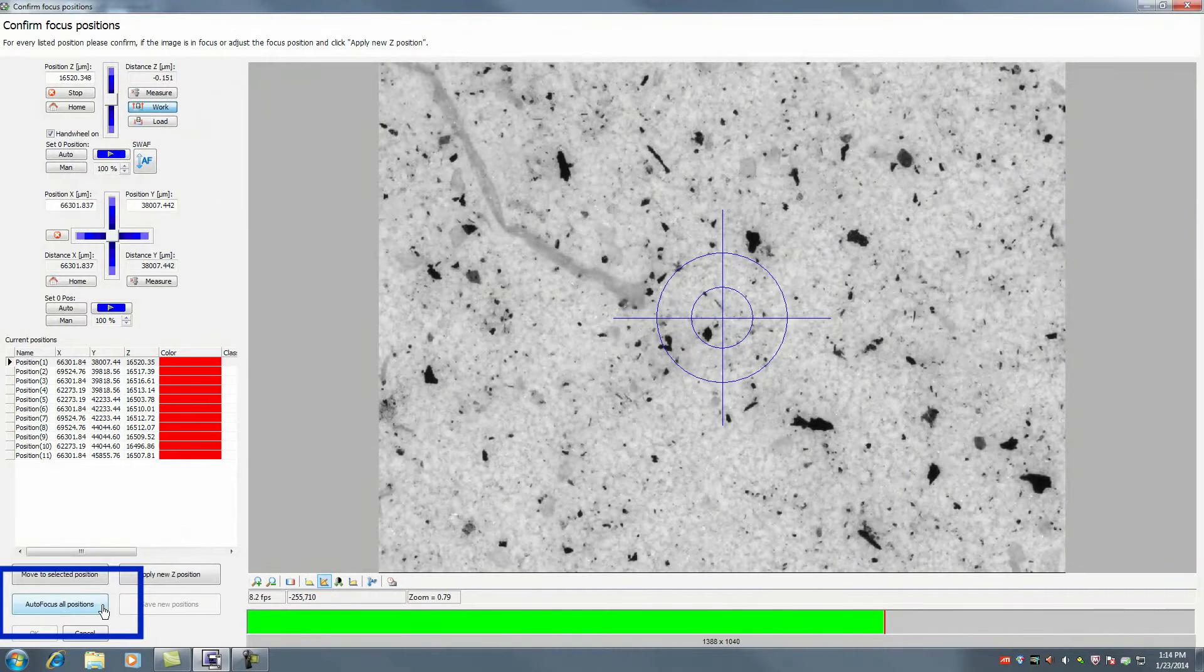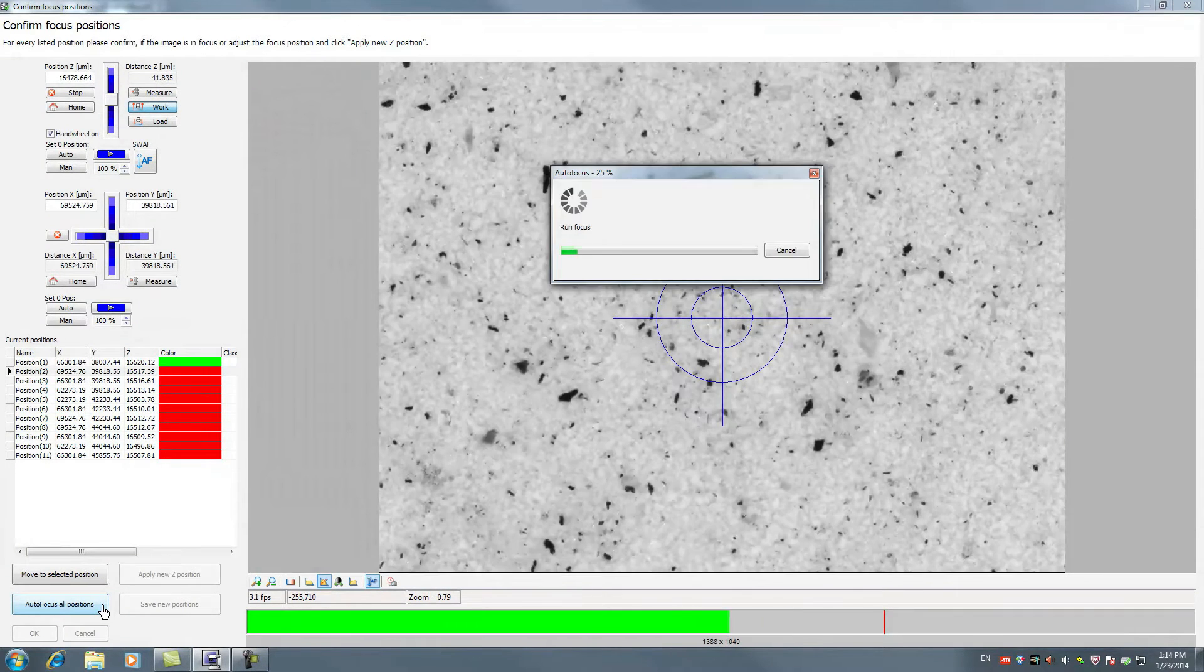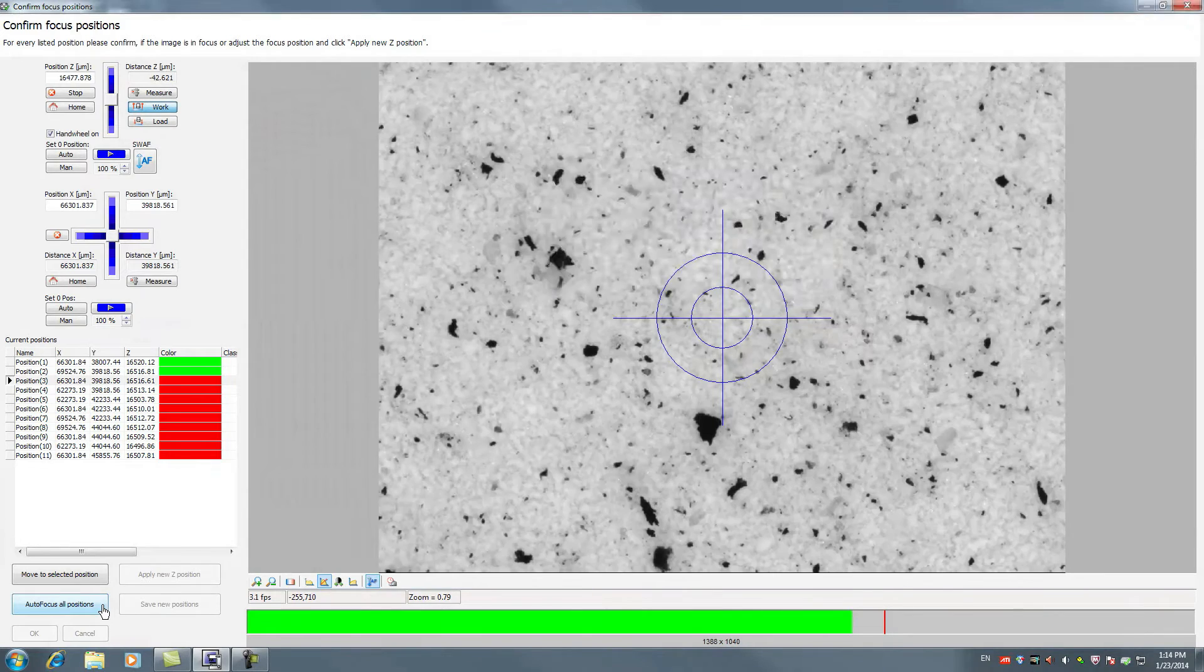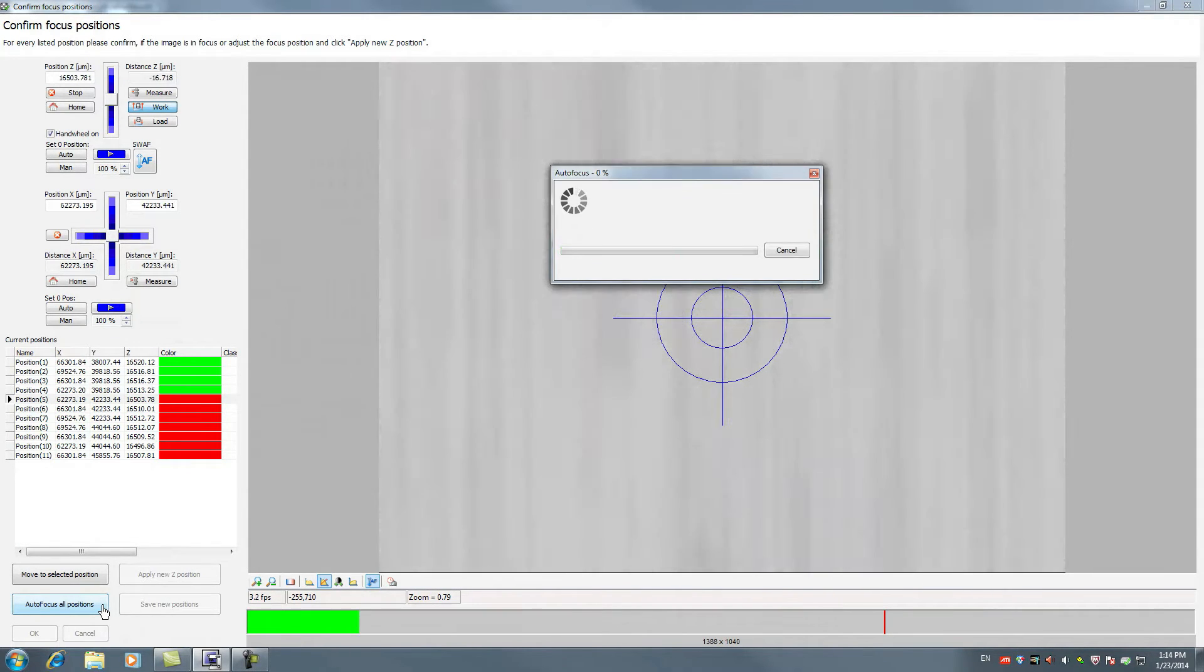Make sure that even the smallest particles will be detected by clicking Autofocus all positions.